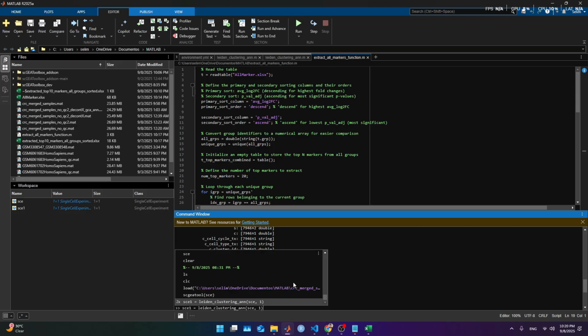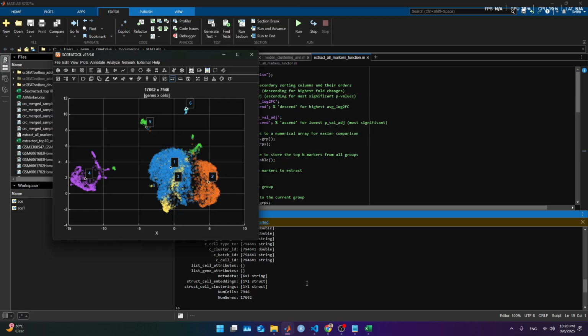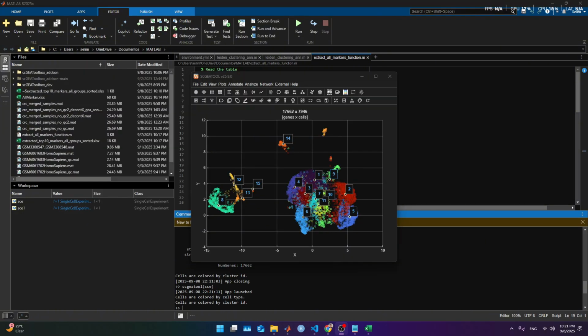Right, it finished. So oh my god, I screwed the thing. I overrode it into SCE1. Wait a second, I'm gonna correct it. Okay, it didn't happen as I wanted. I wanted to subsample this cluster and recluster, but what happened is I reclustered everything. But I already feel comfy with the markers for this set and these other 2 ones here.